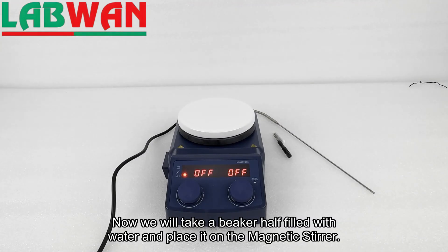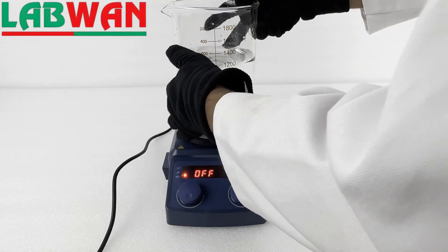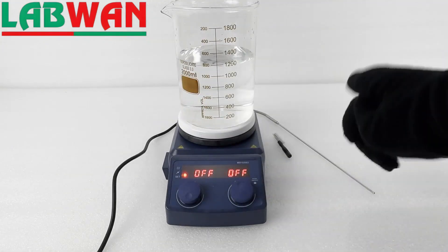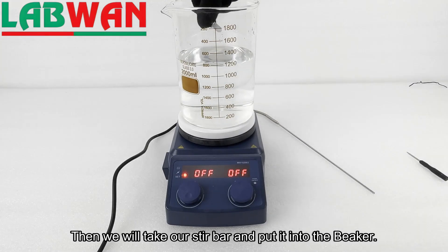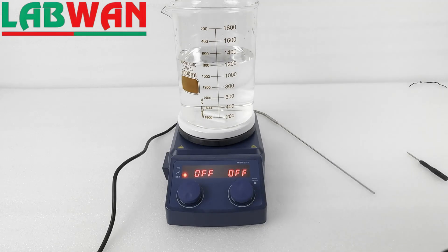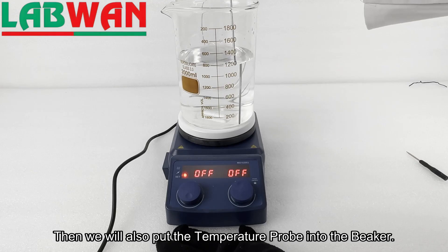Now we will take a beaker half filled with water and place it on the magnetic stirrer. Then we will take our stir bar and put it into the beaker. Then we will also put the temperature probe into the beaker.